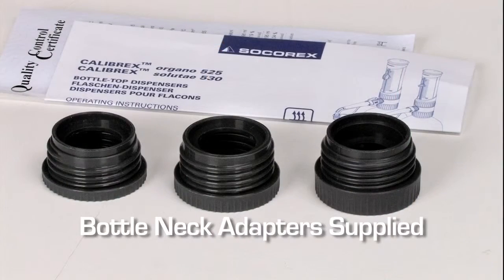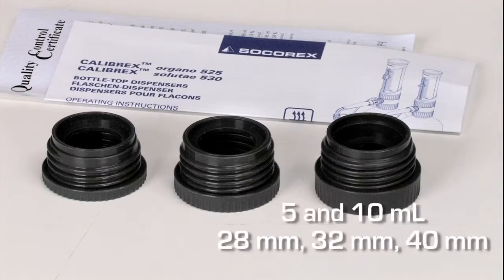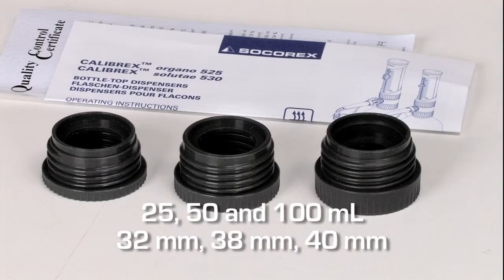Bottle fitting is guaranteed on most laboratory bottles thanks to three additional bottleneck adapters supplied in each box.